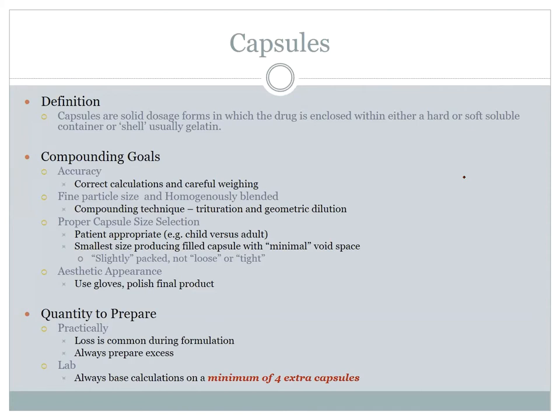So just to be clear, mainly what you think of as a capsule and what you're going to be making today and next week is a hard shell gelatin capsule. They're kind of your normal capsules, but they do make soft shell. And when you do a soft shell, it's usually because you want to encapsulate a liquid. Have you ever seen one of those red docusate capsules? They're kind of like red little football things. Or maybe the longer nifedipine capsules themselves.